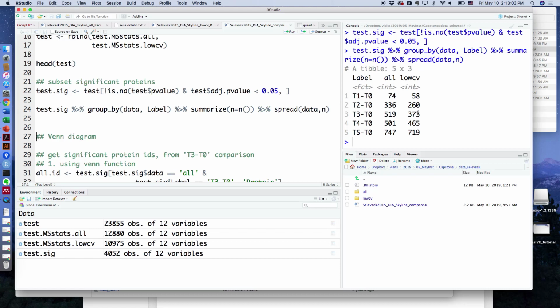So here, first, after a few minutes, not many, but after, I think this is 2 hours, we can see around 700 proteins are significant, and then we expect it should keep increasing. Not increasing and decreasing, we expect this to keep increasing. But if I use all proteins, you can see it is increasing, however, certainly decreasing, and then just going up again. So I will look at what actually happened at T3, which has a bigger difference between the 2 cases.